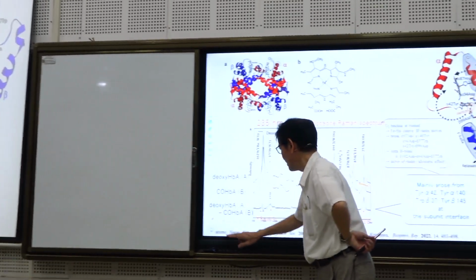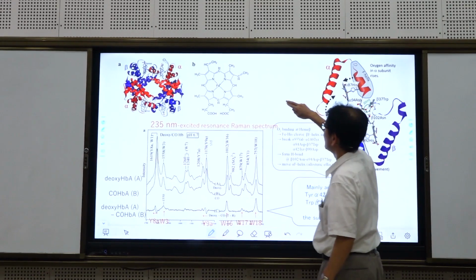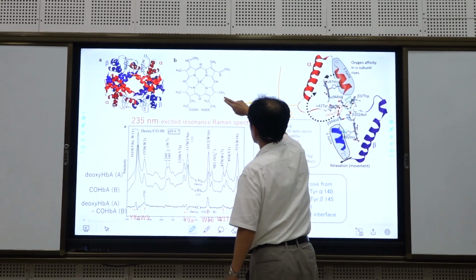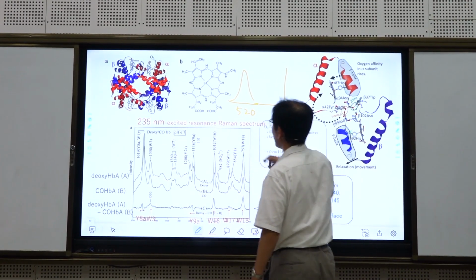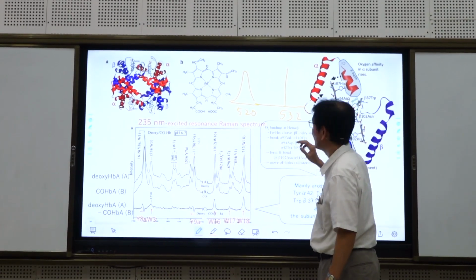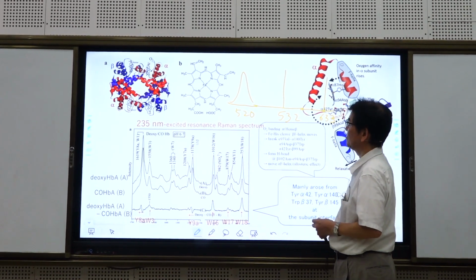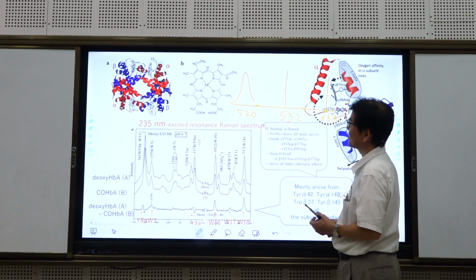You mean you have a laser line at 532 here, and your sample has absorption at 520. And we also have a 633 laser. So which laser should we take to get the Raman spectra of the dye that absorbs at 520 nanometers?